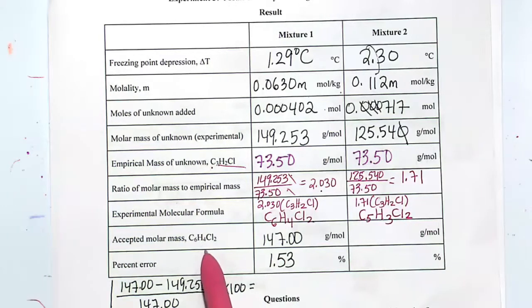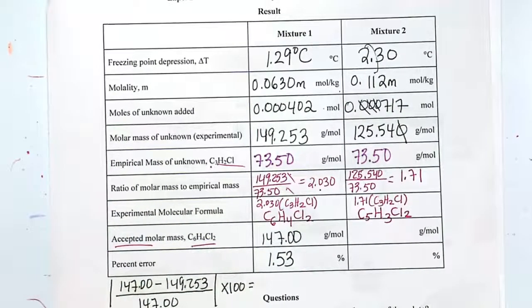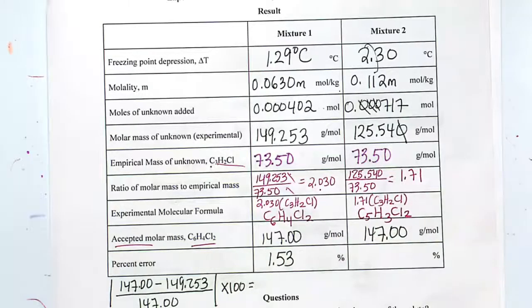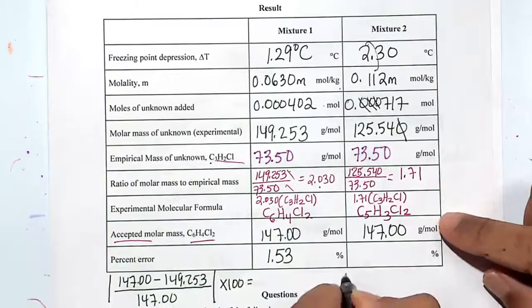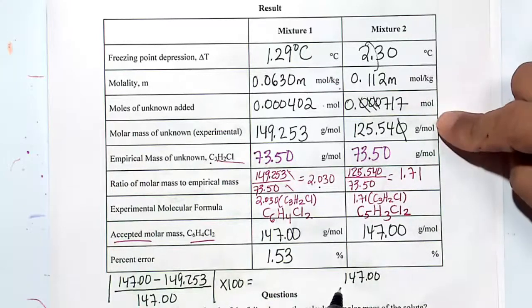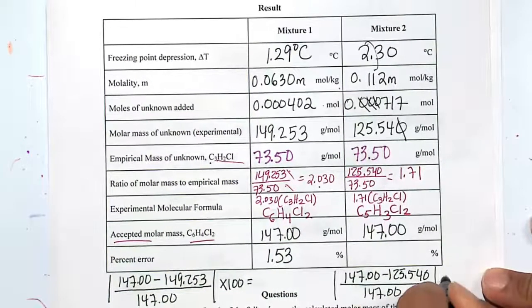All right, the accepted molar mass of this, the accepted is what we get from our periodic table, so it's going to be the same, 147.00 grams per mole. And finally, the percent error for our second mixture. So we take known, which is 147.00, that is something we get from the textbook or the periodic table, minus what we got, 125.540, divided by known. I like to take the absolute value.